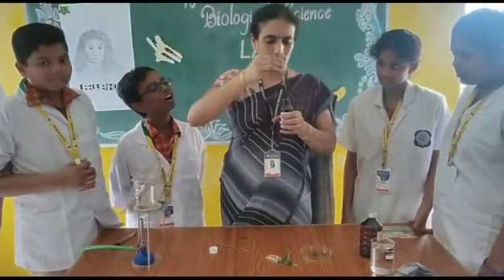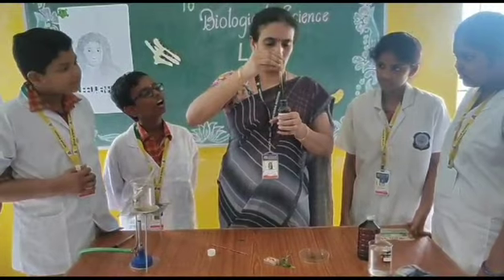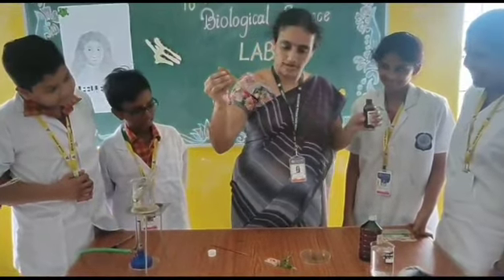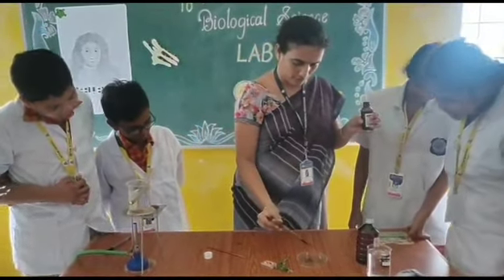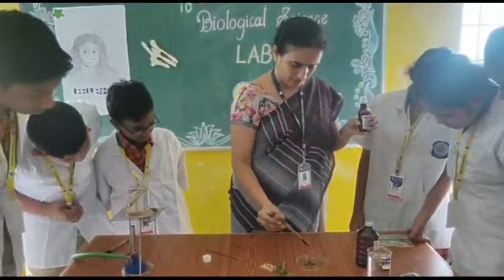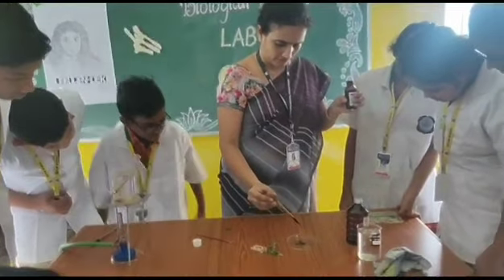Then we put one or two drops of iodine solution on the leaf.